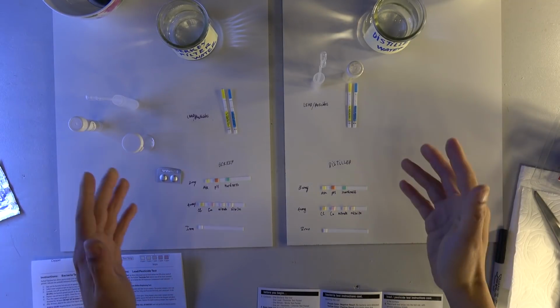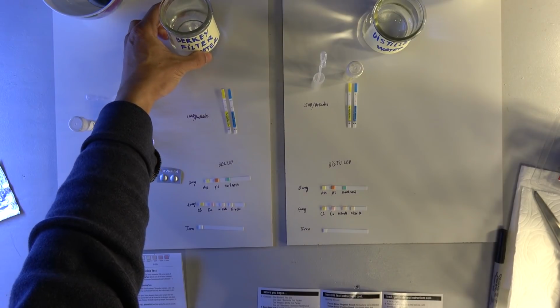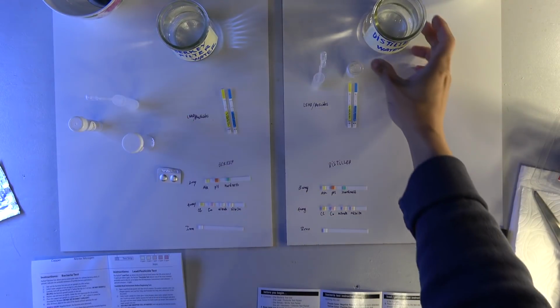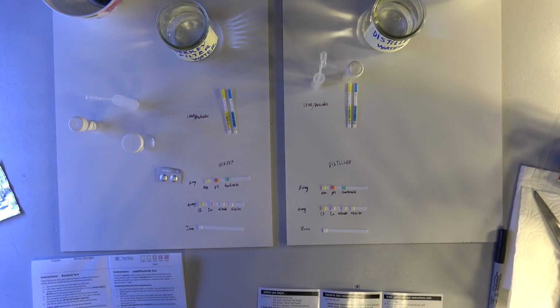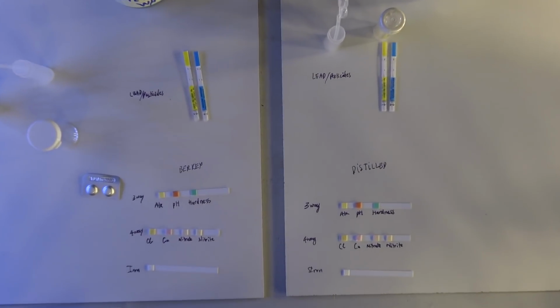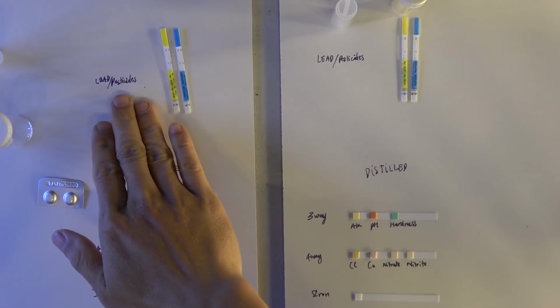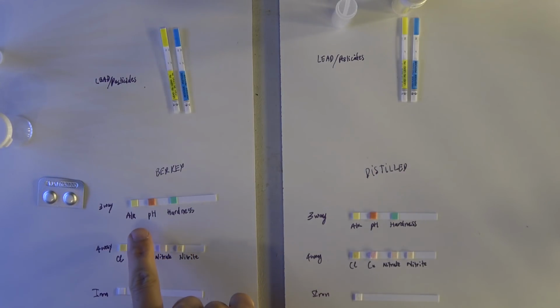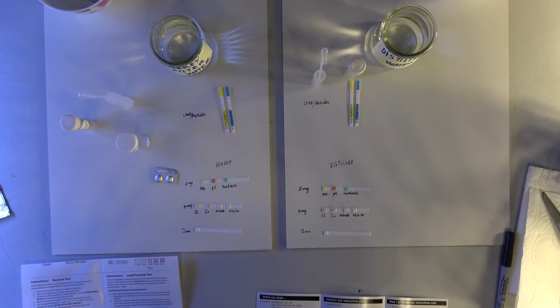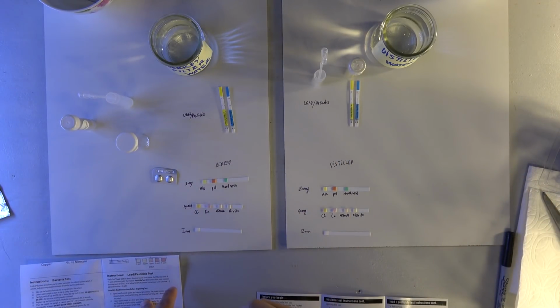Right, so I've got everything set up and ready to go here. On the left side, we still have the Berkey filter water. On the right side is the distilled water. Let me zoom in here. So first we have the lead and pesticide test, and then the 3-way, and then the 4-way, and then the iron. Now I'm going to do the lead and pesticide test first.